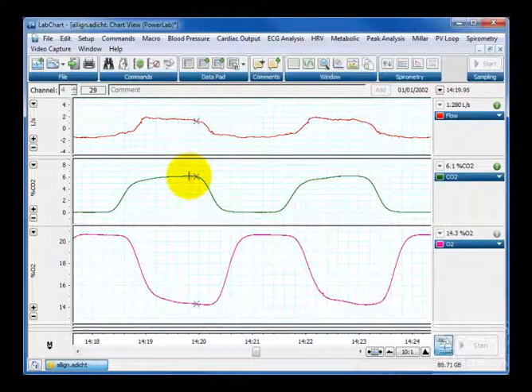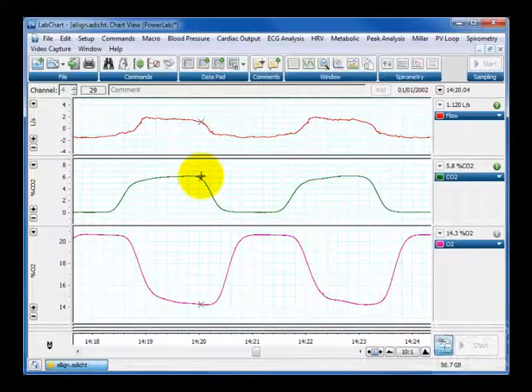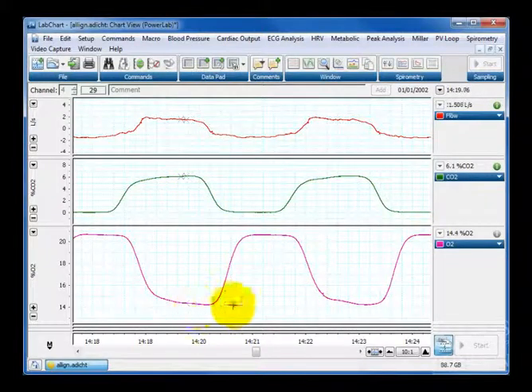So what we may want to do is shift the CO2 forward, or in fact shift the O2 backwards, which is far more applicable because the CO2 couldn't have possibly preempted the end tidal. It's clearly doing it in real time whereas the O2 has a slight lag.